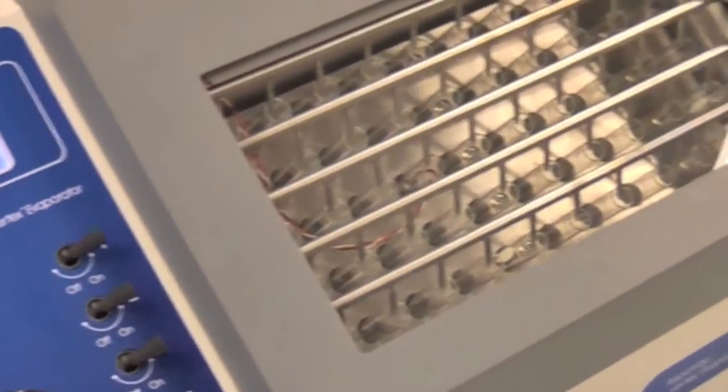Nitrogen evaporation using LabConco's new RapidVap Vertex is not all wet.